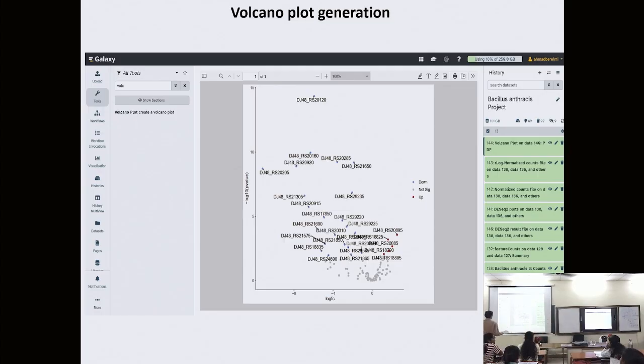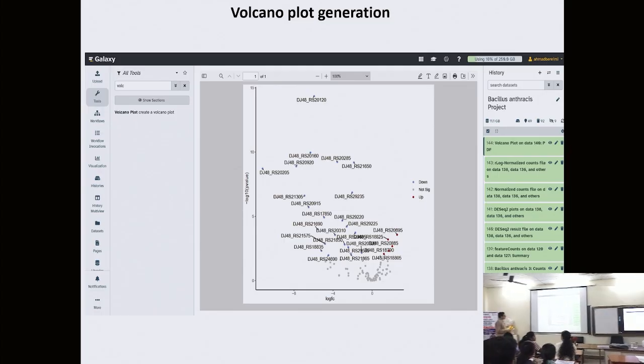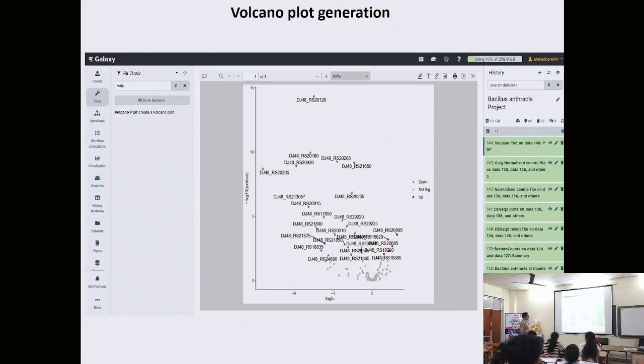You would want to look for the genes whose fold change indicates upregulation or downregulation relative to the control. If it is neither upregulation nor downregulation, what would the value be? It's a ratio, so 1, and log 1 is 0.